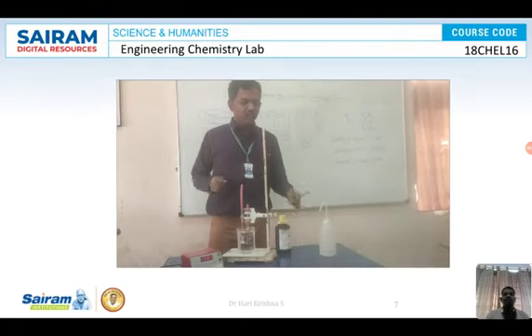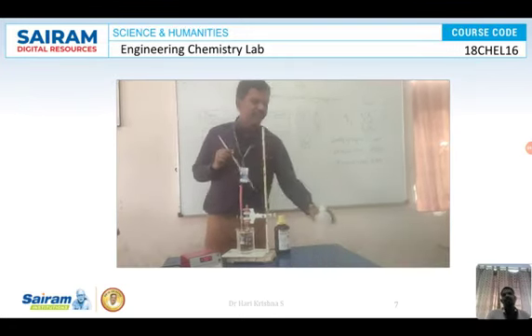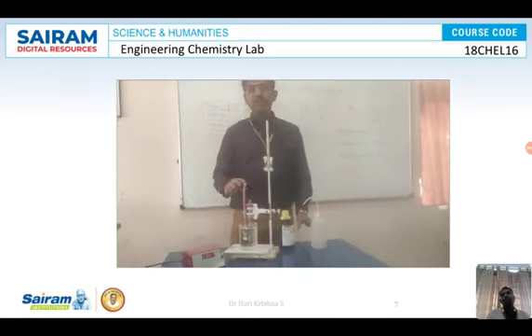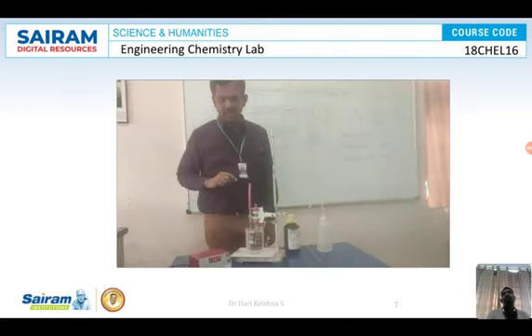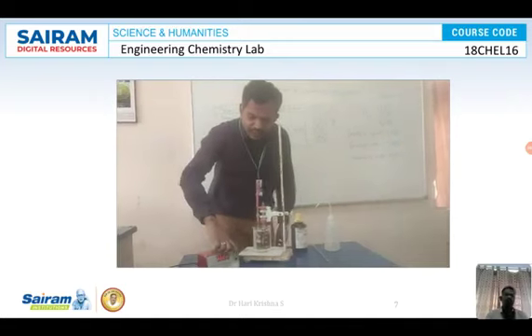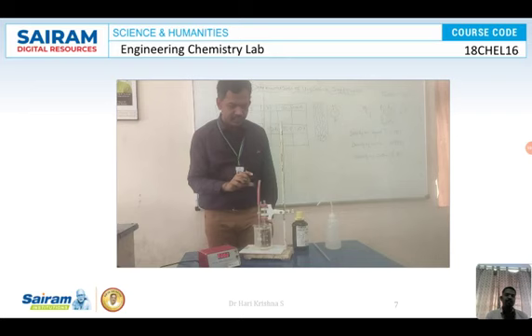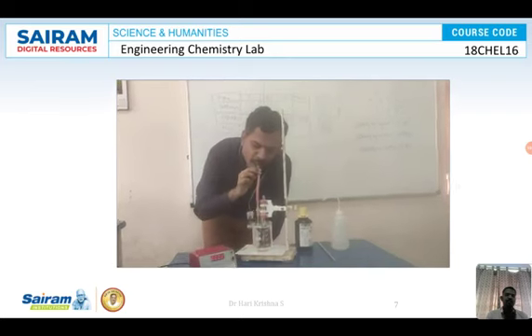Now for water, we are going to take 10 ml of deionized or distilled water, fill it in the viscometer and repeat as we have done earlier. So going to set it to 0. Now pour 10 ml of water into this, and repeat as done earlier. Going to pull this once again.